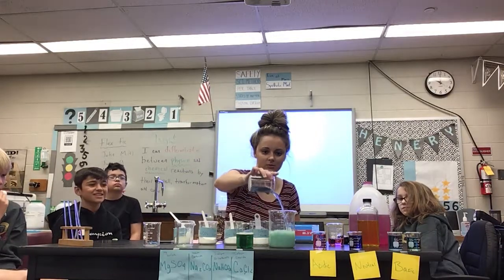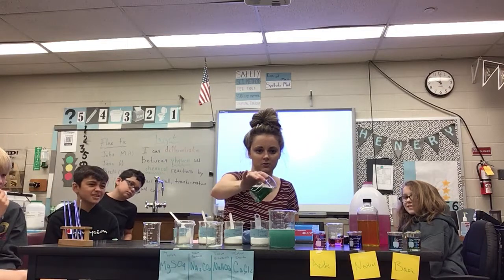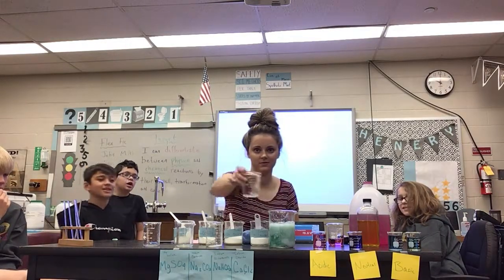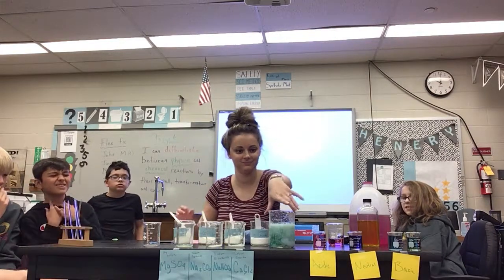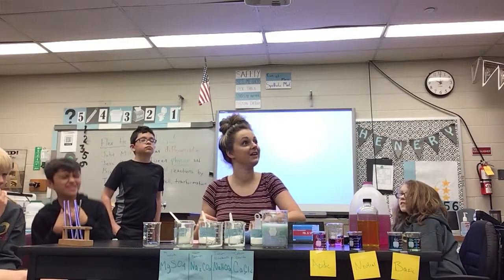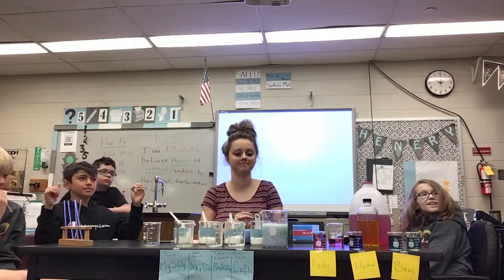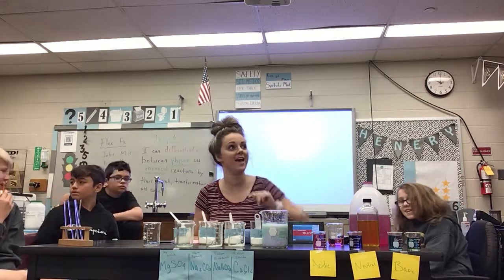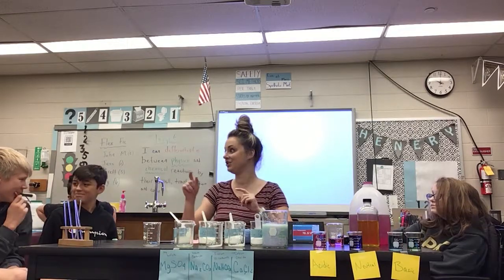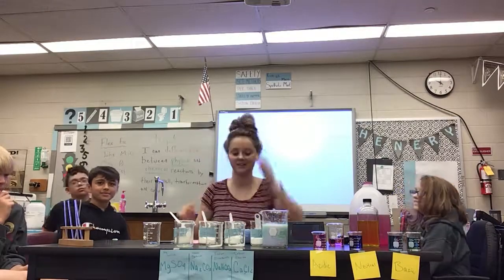It's like green dyed milk. Condensed milk. That looks like boiled milk. What's it starting to do? Oh, it's starting to turn purple. Because there's acidic things and then basic things, and together it's neutral. And what's it starting to form? It starts with a P. Precipitate. Nice job. Precipitate. Pause that, please.